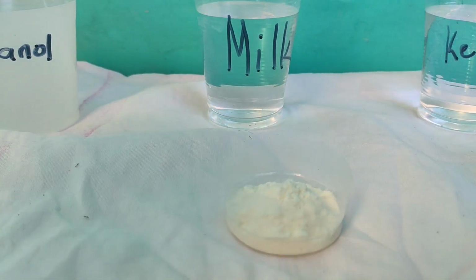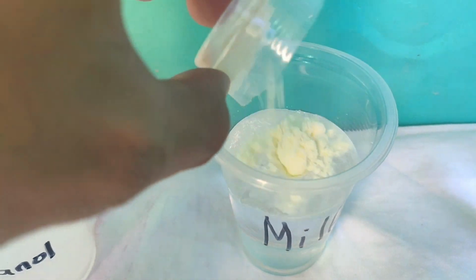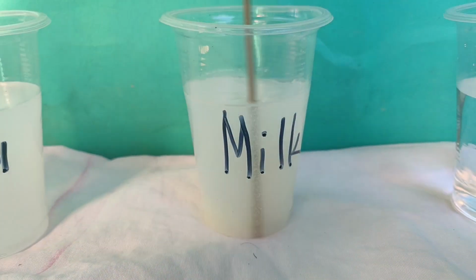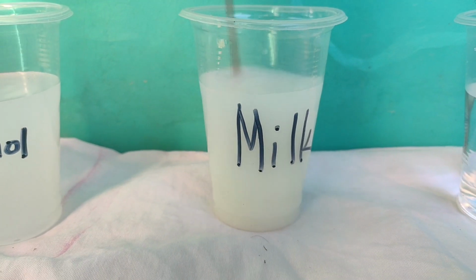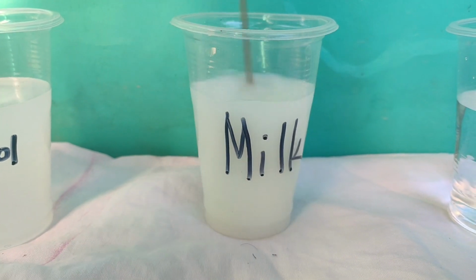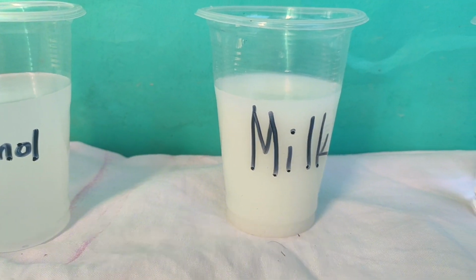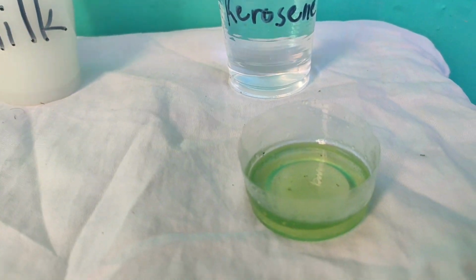And here for the milk, I put at least 1 tablespoon of powdered milk. Again, I'm using a stick for mixing. As we can see, it's the same as the ethanol, it changes color because of the powdered milk. We can see here that it's more foggy, it's more white.